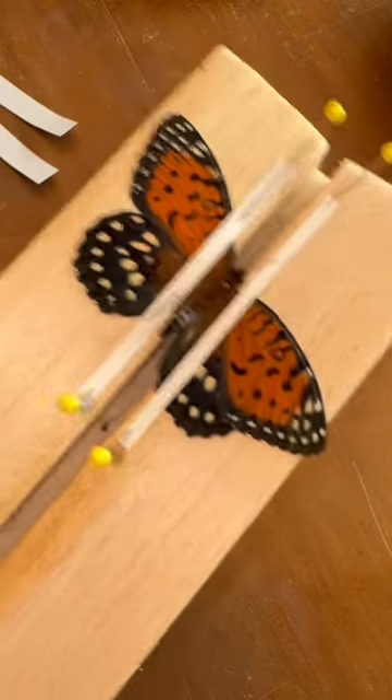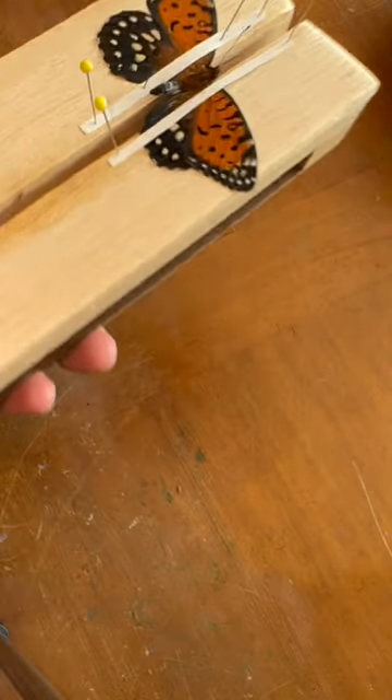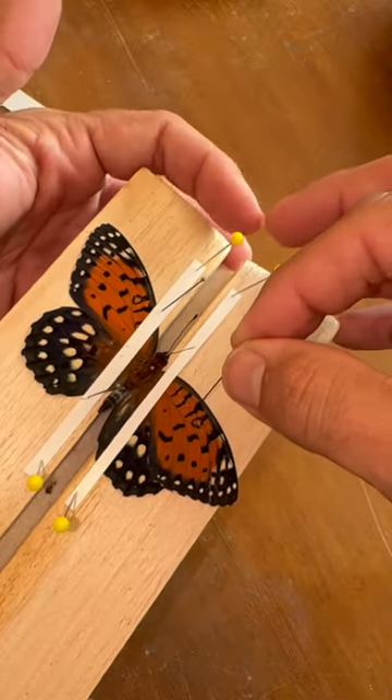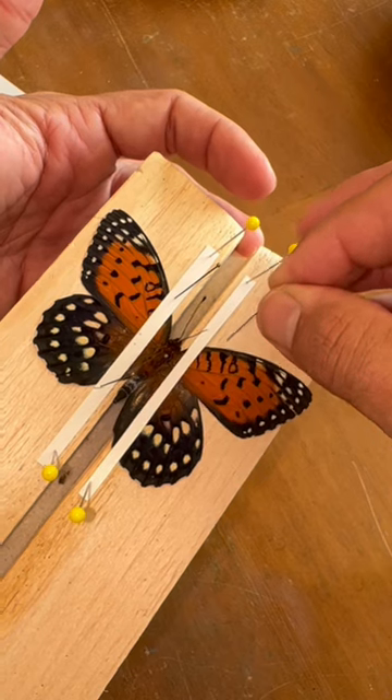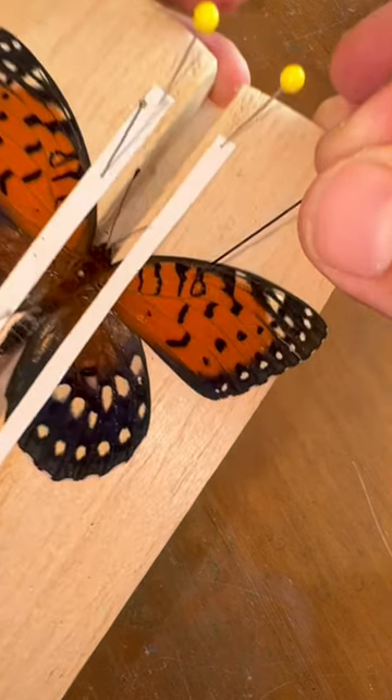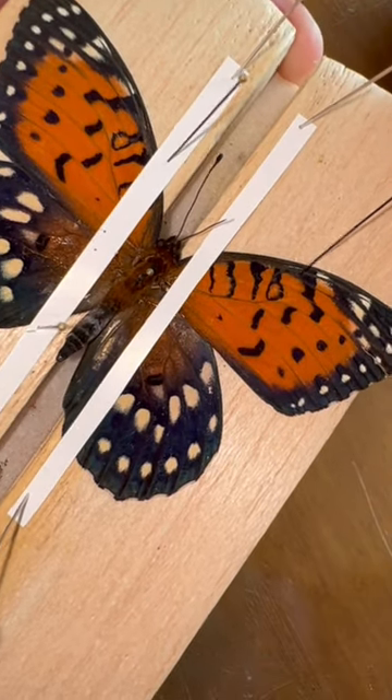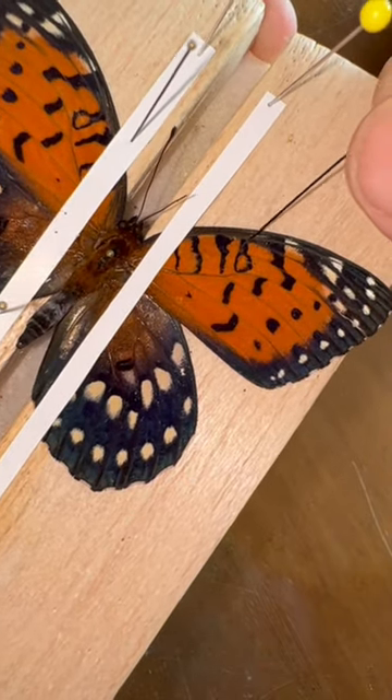There it goes. All right, time to do the other side. Same thing — there's a vein that goes right along the top edge of this wing, and I'm going to use that vein because it's nice and firm.